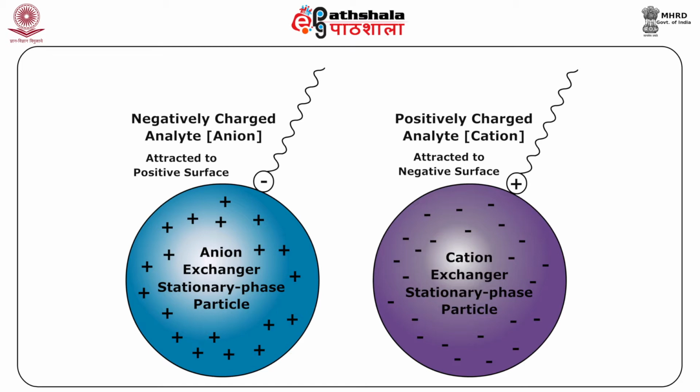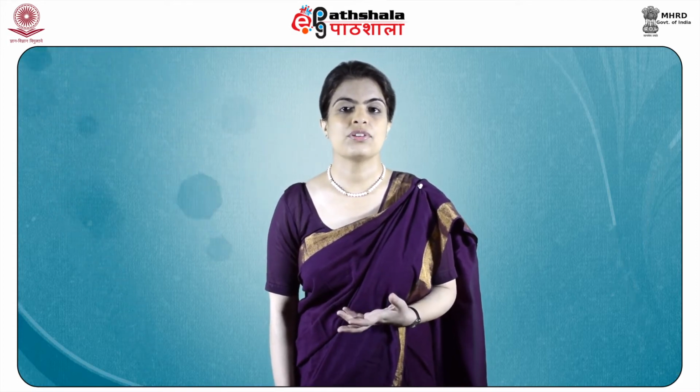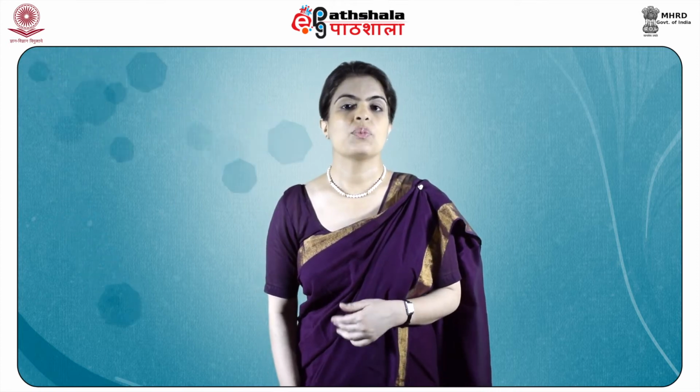shows the cation exchanger. Some groups are more strongly ionic than others and are referred to as strongly cationic or anionic, while some groups are weakly ionic and are referred to as weakly cationic or anionic. Sulfonic group SO3- is a commonly used strongly acidic cation exchanger. If it binds an H+ ion, it is said to be in its acid form. It can exchange one sodium ion for a H+ ion and one calcium ion for two H+ ions.